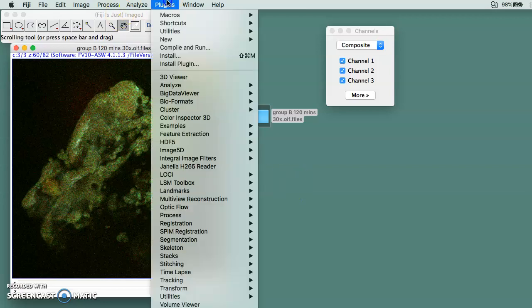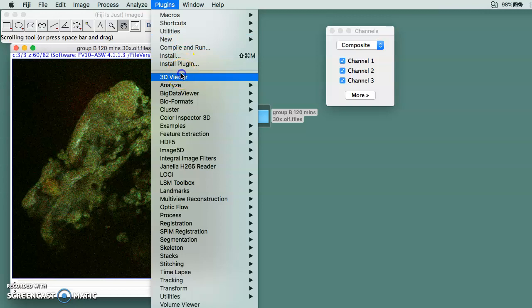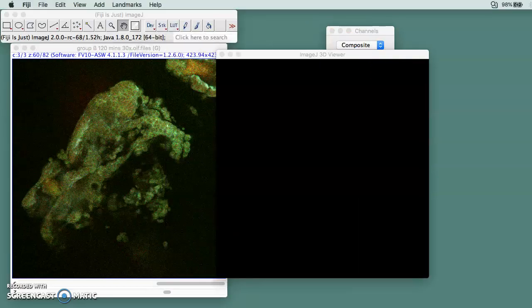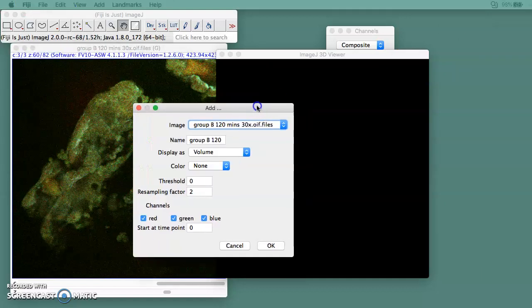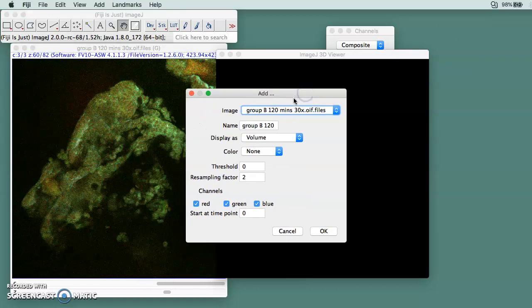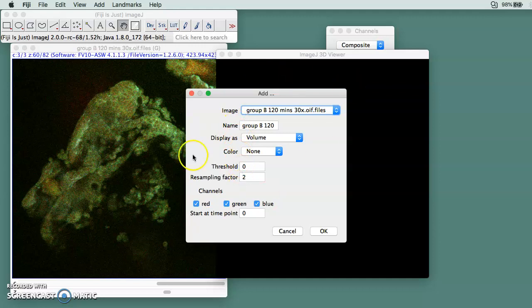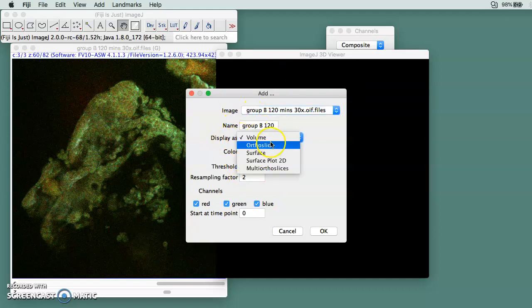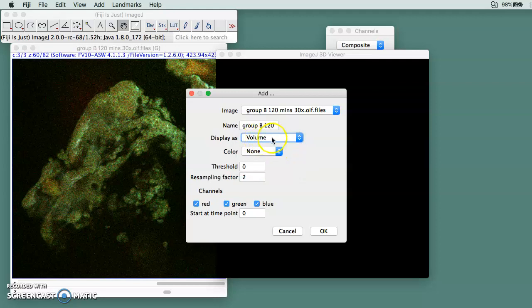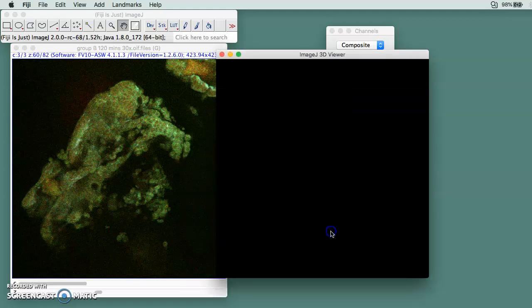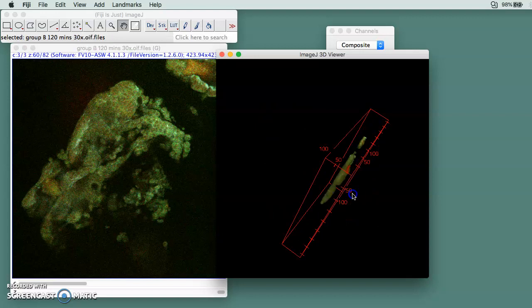Next thing you do is click Plugins and then go to 3D Viewer. This window is going to jump out asking if you want to display it as volume or something else. For me, I just need the volume and then you click OK.